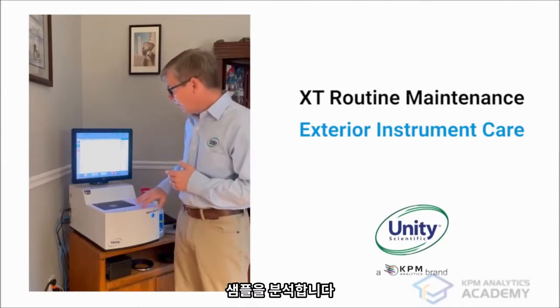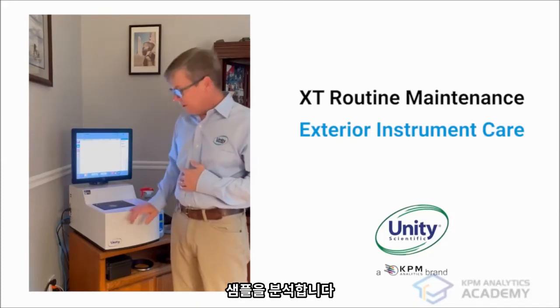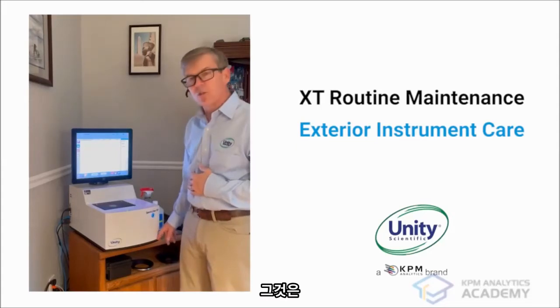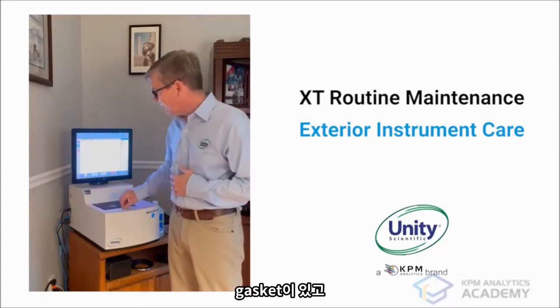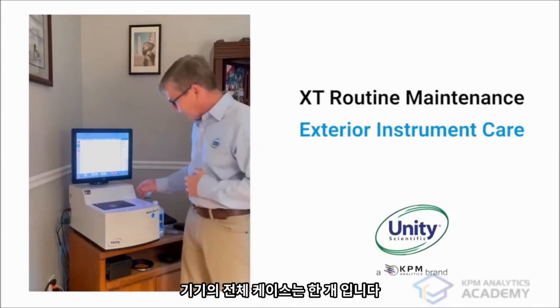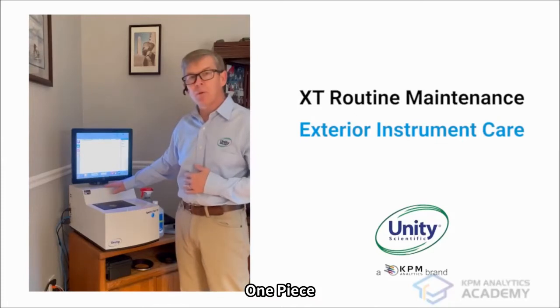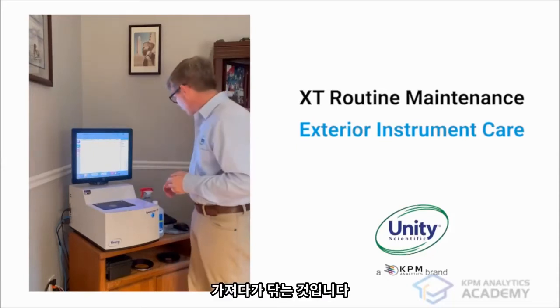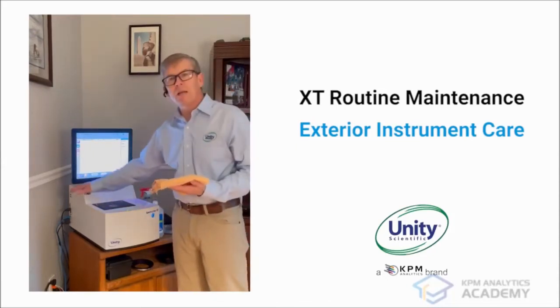So the XT itself is a sealed case. There's some sealing weather stripping that's across the bottom. Around the sample presentation stage, there is a gasket, and the entire case of the instrument is one piece. The top case is one piece. So really, for the case itself, all you need to do is take some sort of a microfiber cloth and just wipe it down.